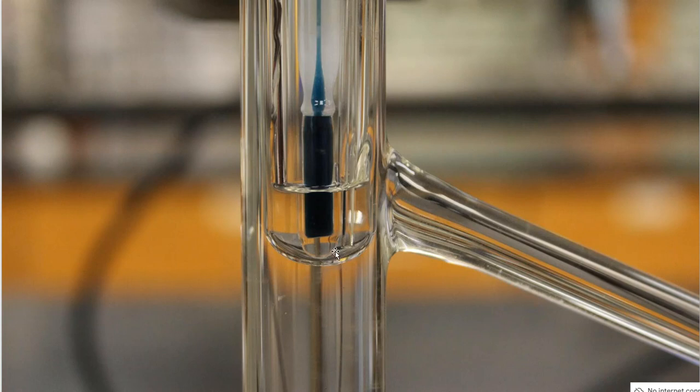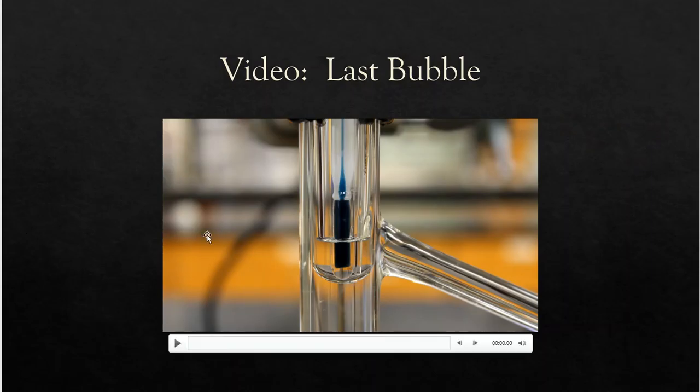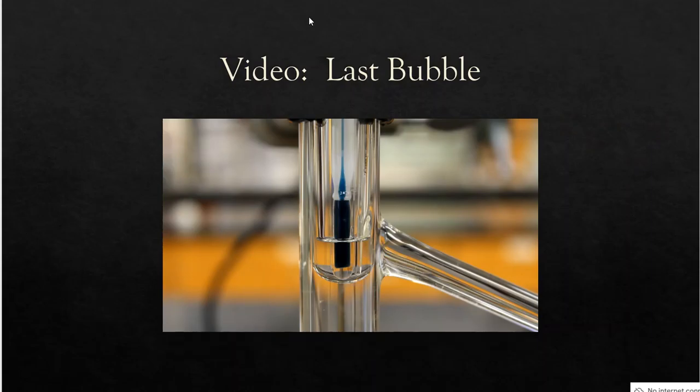So here in this image, the bubbles were slowing down. You saw that in the video, right? So I'm going to make another temperature recording. And this is the temperature of the thermometer, but I was still getting bubbles at this point. They've slowed down, but I'm still getting them. But I'm getting closer to my boiling point. All right, so finally, we need to watch for that very last bubble.